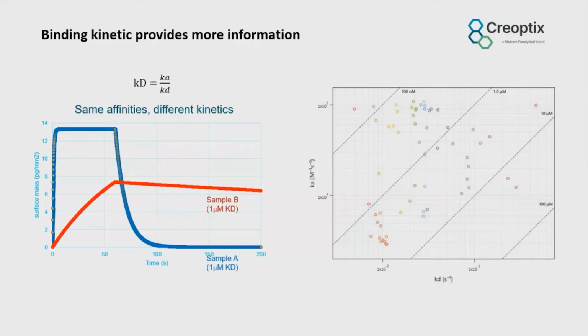So perhaps by doing this kinetic screening, we can introduce the concept of kinetic analysis much earlier in the drug discovery process, and really tailoring the best binders for the application that you're interested in.